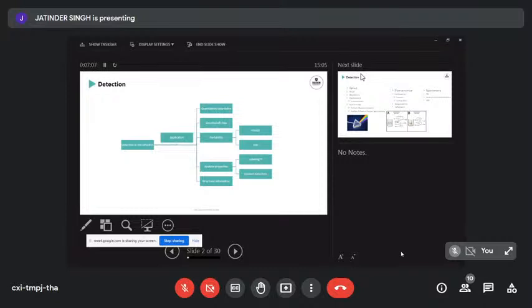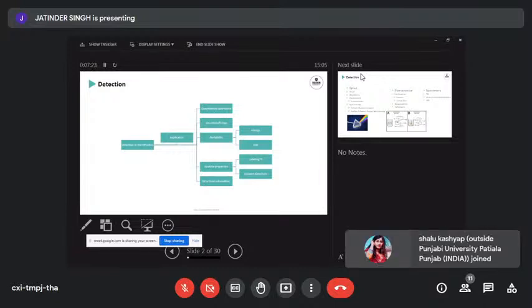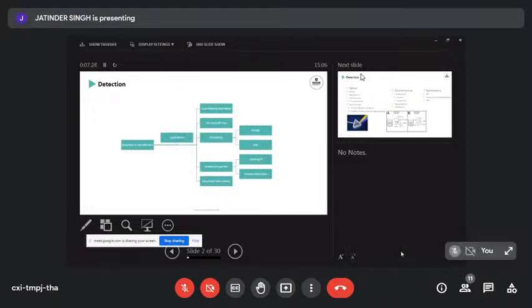The last consideration for your application that's important is, are you actually looking for something that's known, or are you looking for the unknown? A lot of work in proteomics, they have just no idea what they're going to find. So they'd like to have a mass spectrometer, so they can kind of have a very special balance and can measure the mass and therefore identify what was in their sample. Whereas a lot of other assays are, if you want to measure a pesticide that you know is used in a certain region in fruit, you know the pesticide that you're after.